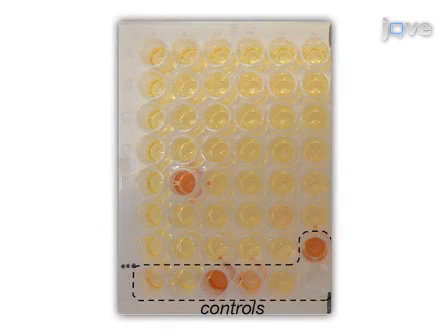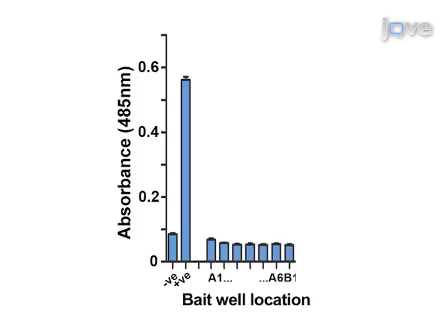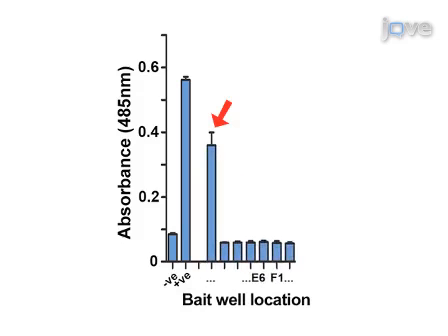The final step is to add the substrate for the enzyme to detect any captured prey on the arrays of bait proteins. Ultimately, the results of an AVEXIS screen can show which cell surface receptors are able to form binding partners and may therefore be involved in the recognition and communication processes between cells.